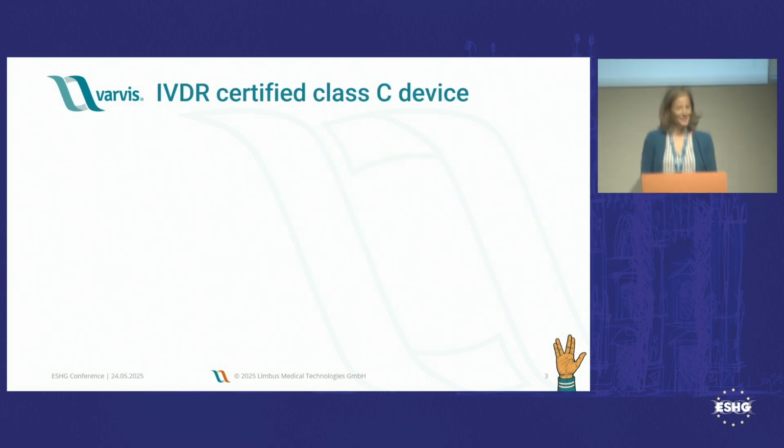Let's remind ourselves why this is important. The IVDR regulates clinical diagnostics throughout the EU.